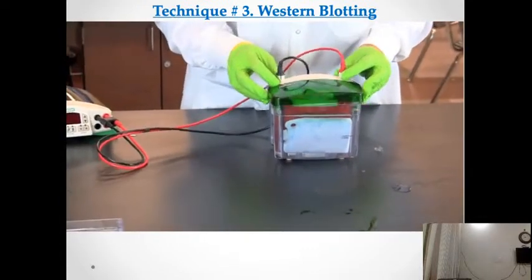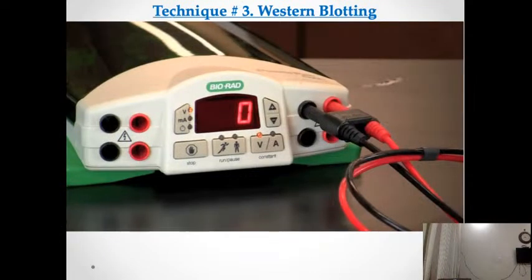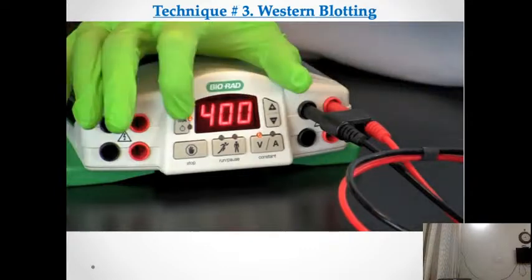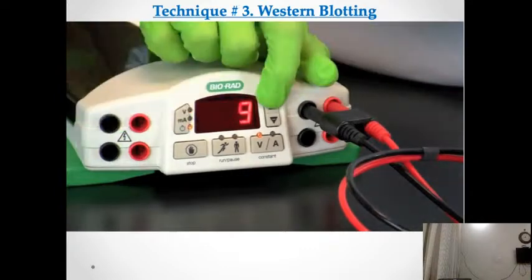Place the lid on the electrophoresis chamber. Connect the electrical leads to the power supply, making sure the connections are correct, red to red and black to black. Turn on the power supply and run the blot. If a timer is available, set it for 2.5 hours.